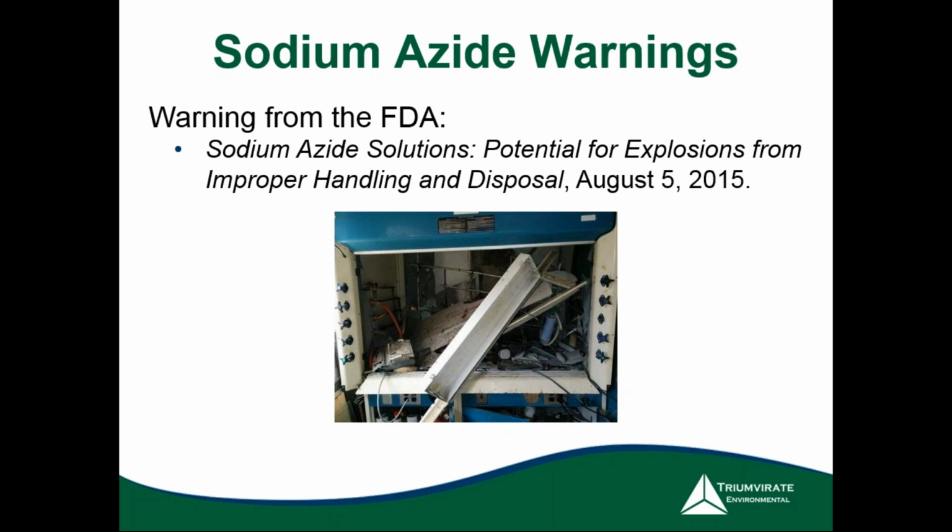Talking to people where this actually happened to them, I really wanted to find out everything I could, and they described it as something similar to a .22 caliber bullet being shot. If you can relate to that, it's just a loud, quick pop, but that force is enough to release shrapnel from copper. It's enough to really cause psychological trauma and also ear damage and other skin damage.